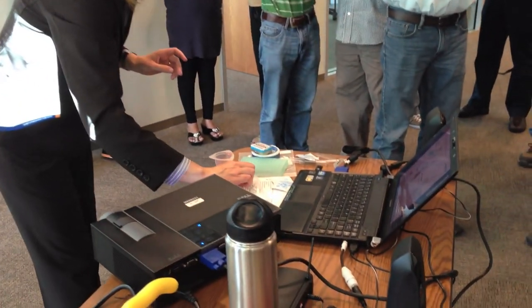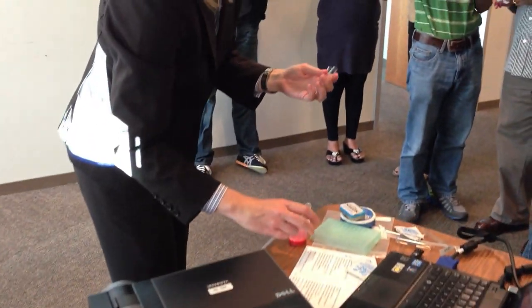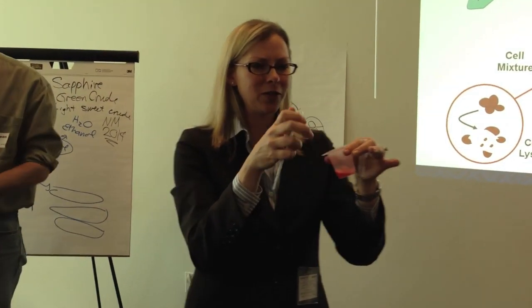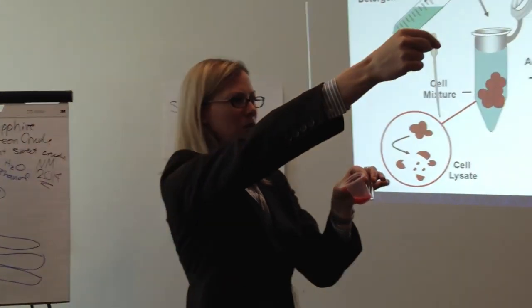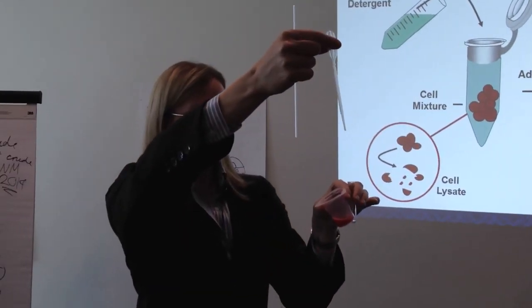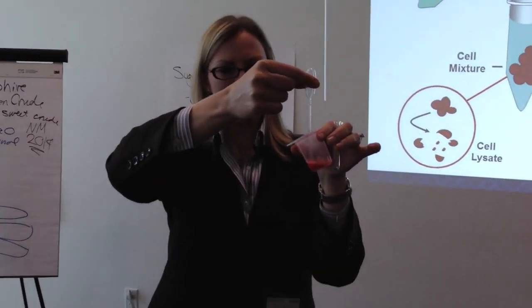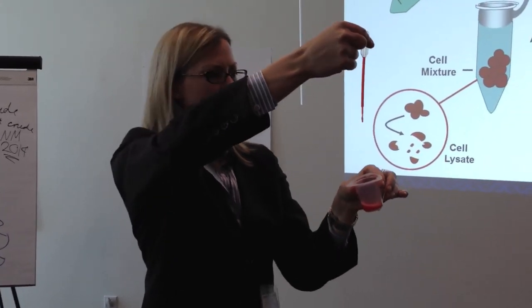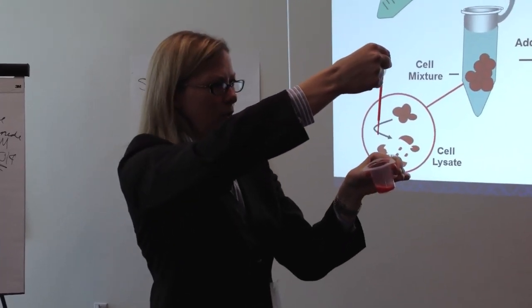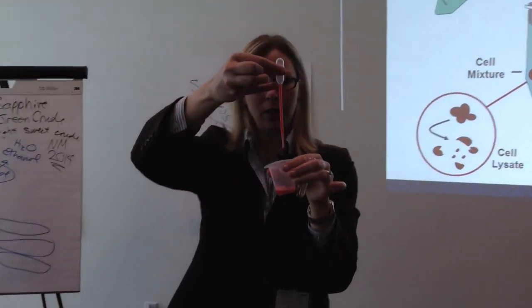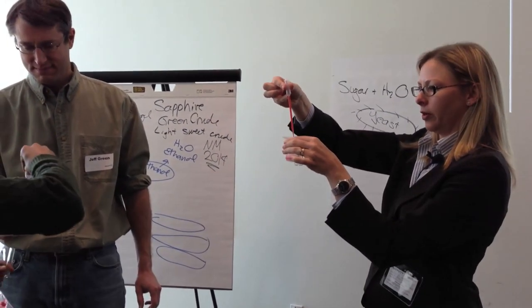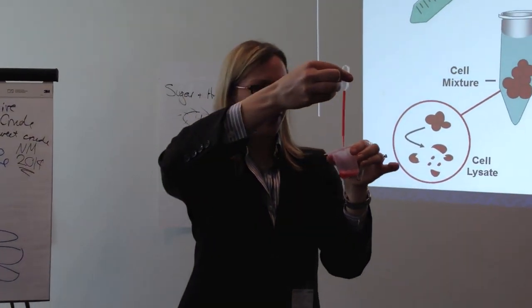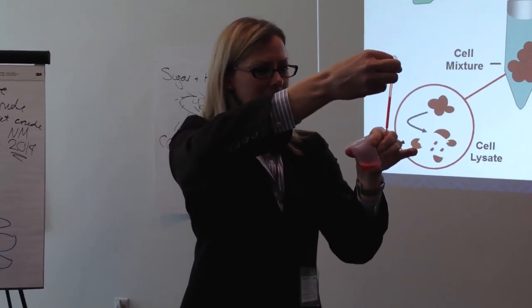Now you should have some glass test tubes. Looks like we've done some sort of horribly bloody - so you're going to have a glass test tube and hopefully there's one for everybody. What you'll do is you'll use this little squeezy pipette. Squeeze the bulb, place it into the strawberry cell lysate, and then release the bulb. We want roughly one milliliter. Do you guys see how much I have? It's just about up to the neck of the pipette - one milliliter. You'll go ahead and transfer that into the test tube.